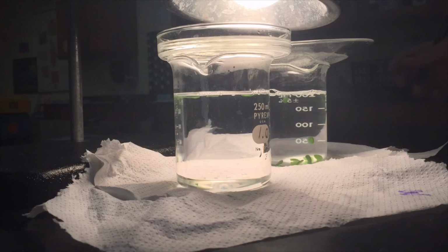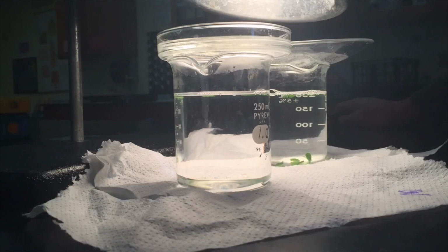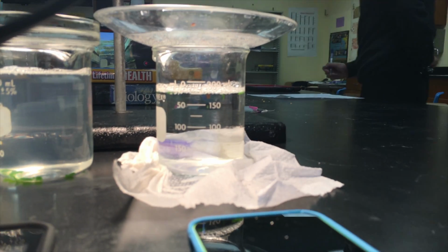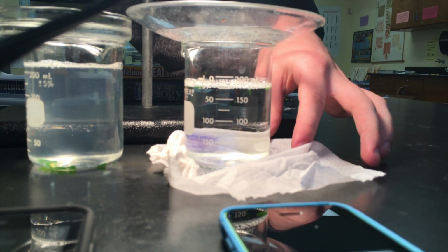Unique variance within the dataset can possibly be explained by differing distances from the light source, variation in original oxygen level/capacity, or possible unknown, unforeseeable contaminants within the water sources. Most of these are uncontrollable. However, the light source distance could be better controlled in future trials. In this case, the distance varied as the lamp had to be lifted to exchange the test beakers with other test samples.